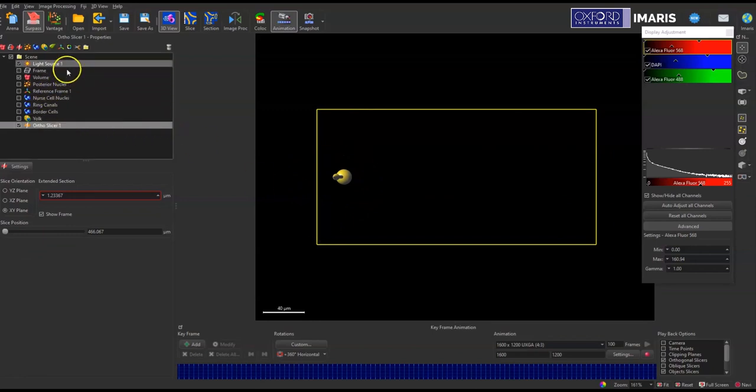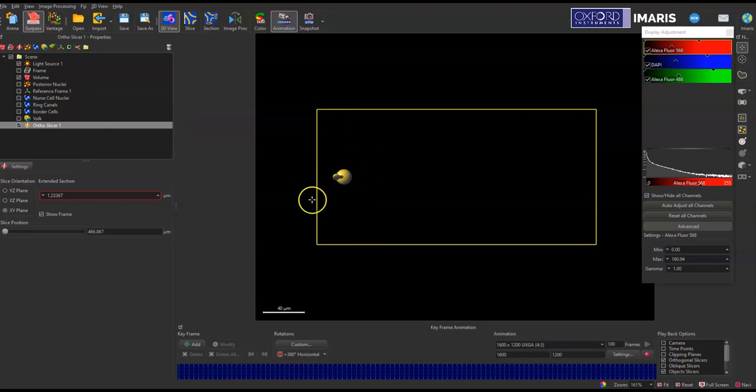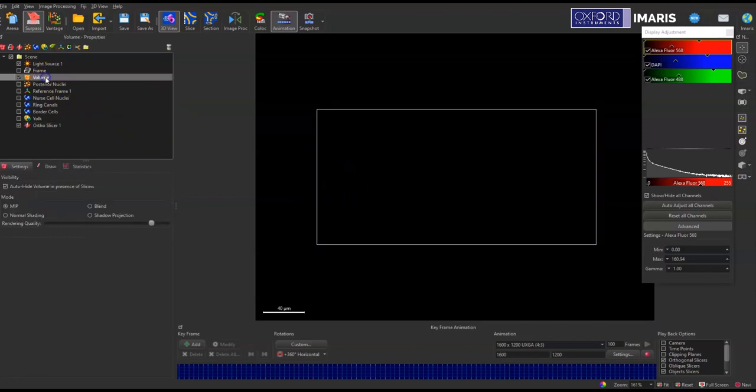So I'm just going to click on a different item in the surpass scene to turn off this yellow ball and arrow. So I can click on the volume button here and you can see that it disappears.